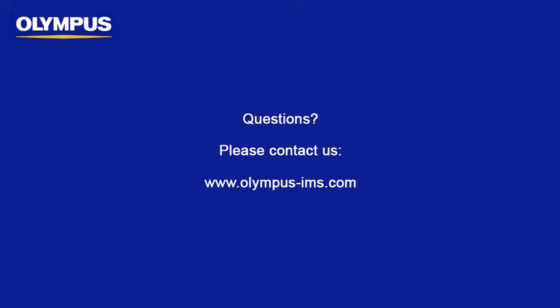In this instructional video, we have covered 3D standard live panoramic imaging within the Olympus DSX series opto-digital microscopes. We hope this video has been beneficial, and we invite you to contact us directly with any questions.